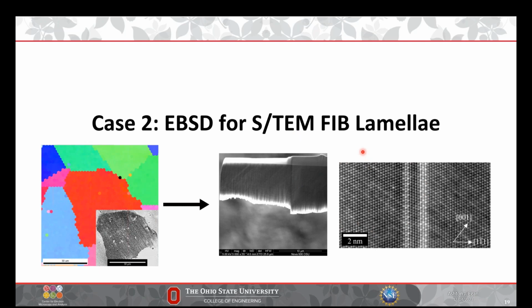Just to give a quick preface, if you don't know much about TEM and atomic resolution analysis, you basically want very, very thin foils, something along the lines of maybe 50 nanometers, if not thinner, if possible. And for the purposes of doing EDS, which is chemical analysis, we want these to be basically untilted once we load them into the TEM. This has to do with shadowing of the EDS detectors if we tilt, but also when you tilt a foil, you effectively make it thicker to the beam direction. So we want to load this TEM foil and be bang on its own axis and just start doing analysis. And so how do we do that, and how do we leverage EBSD to let us do that?